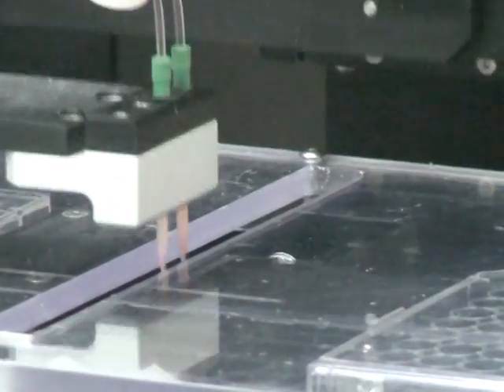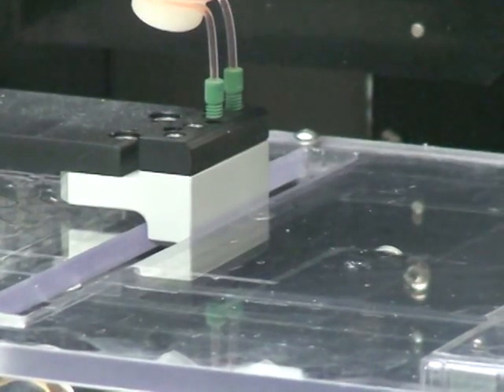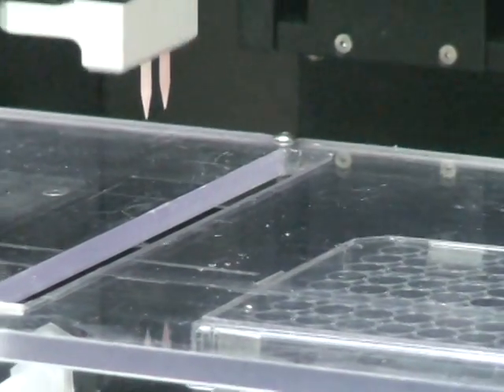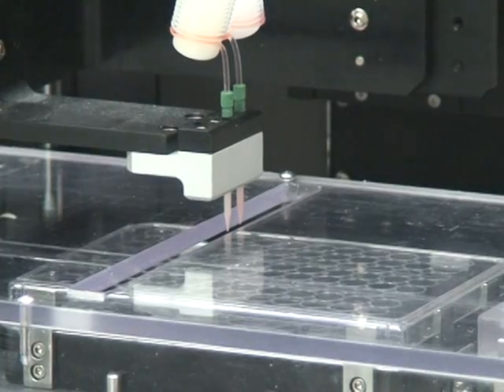The instrument we're showing here has two channels and has the ability to dispense to 96, 384, 1536 well plates, as well as virtually any flat substrate, microscope slide, or other flat surfaces.